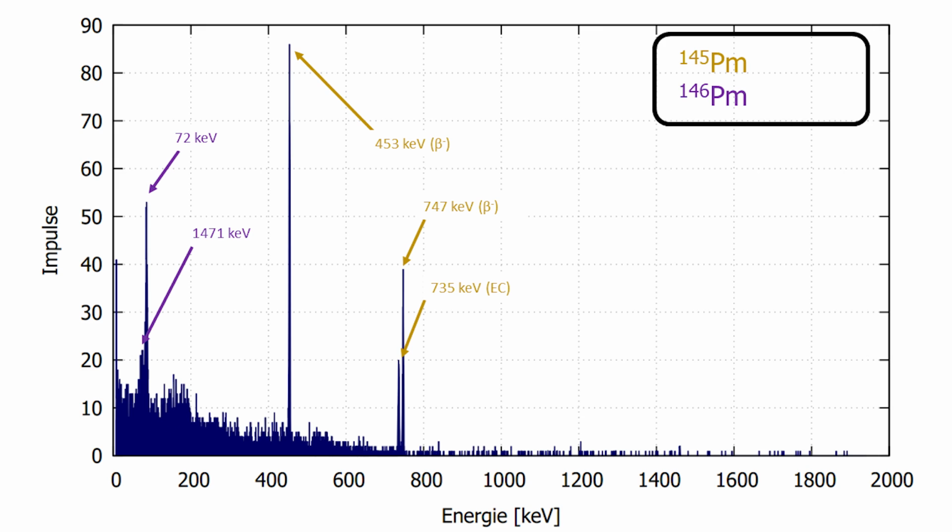First, the gamma spectrum. Promethium-147 is quite challenging in this regard, with a probability of the 121 kiloelectron-volt line of 0.003%. You can't see that. But what you can see are the lines of promethium-146 and 145 in our sample. As I've mentioned, all promethium is produced from fission products, and the other isotopes can be formed as well. Isotopically pure promethium would be just unnecessarily expensive. The low energy range is broadened because I've measured it through the lead vessel.